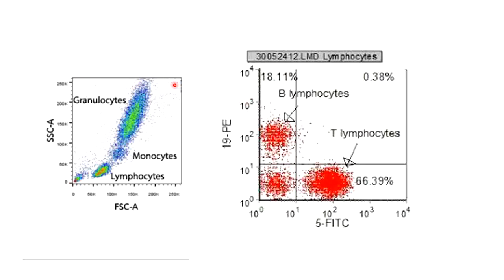In the first graph, on the x-axis I have FSC. As soon as I hear the word FSC, what comes to my mind is that this axis gives me information about the size of the cell, because forward scatter is the measurement of what? Size of cell.